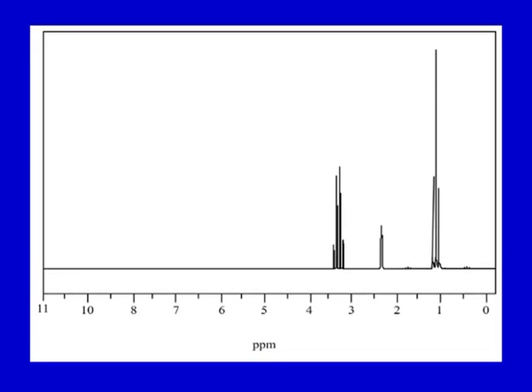Signals in a 1H NMR spectrum do not necessarily appear as a single line, because there is a splitting pattern, as we have seen, and this gives information as to how many hydrogens are present on the neighboring carbon. Depending on the split, it will tell about the number of hydrogens, and also integration of the 1H NMR signal allows the number of hydrogens in each environment to be determined. If you see in this figure, depending on how many hydrogens there are, splitting of the peaks occurs, and that is determined as per the number of atoms attached to a particular group.